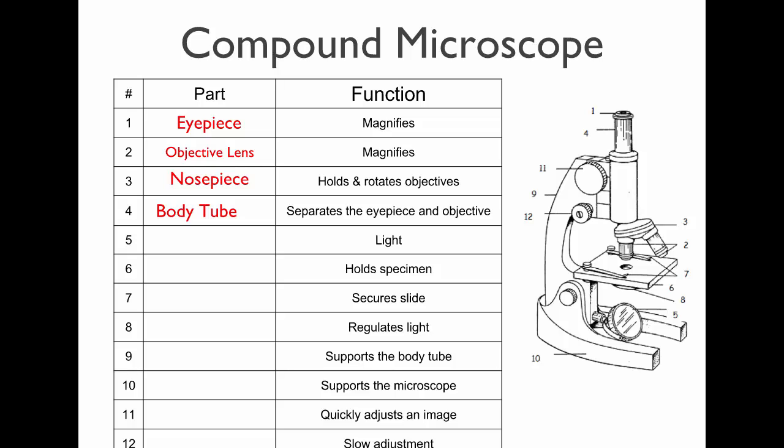There's different types of microscopes that you can get. Our microscopes are cordless. They have a little battery in here, and then they have a light down here, a light source. Some microscopes you have to keep plugged in, like those dissecting microscopes over there. More modern microscopes have a built-in light. What does this have? No? That's a mirror. Older microscopes used to have a separate light that you would shine at it, and then adjust the mirror to shine the light up. We don't really use those anymore. So we have a light there. That's our light source.